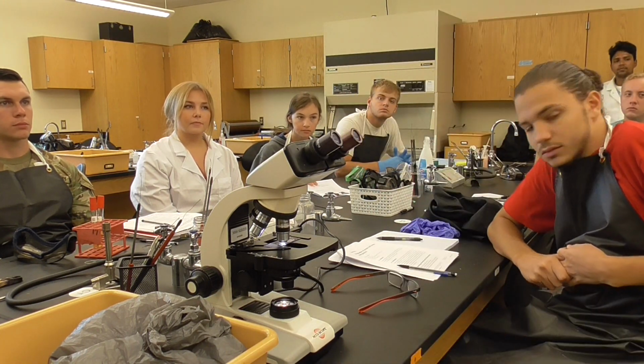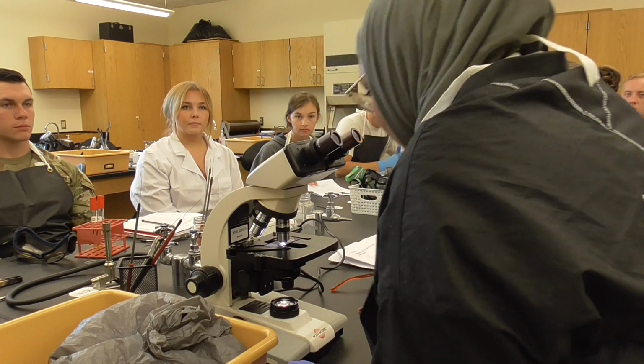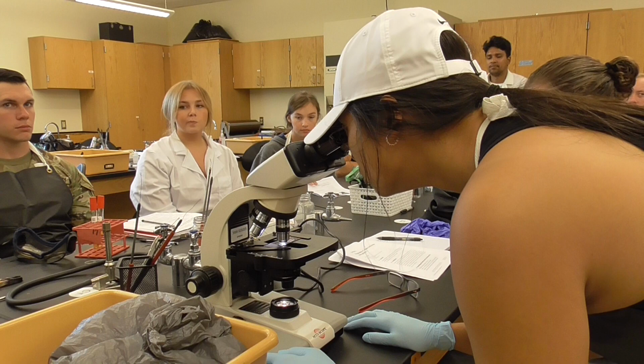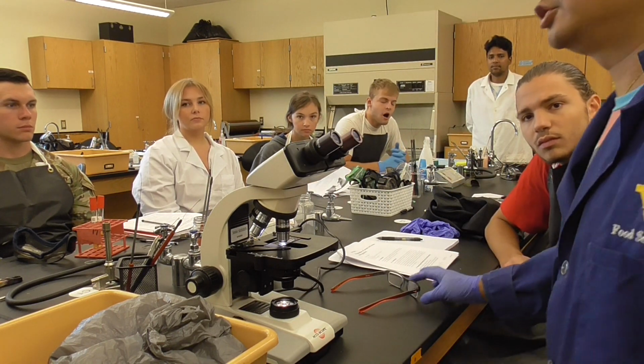Okay, go ahead to see it. That's what's underneath 100x. Okay, go ahead to see it again. So that's what you find. You go to find the bacillus like that. Okay, so that's what we're going to do.